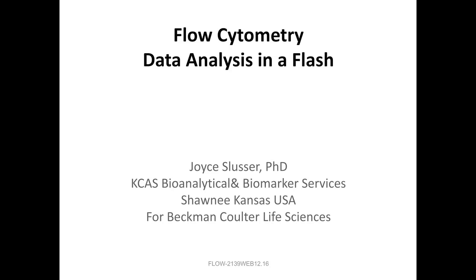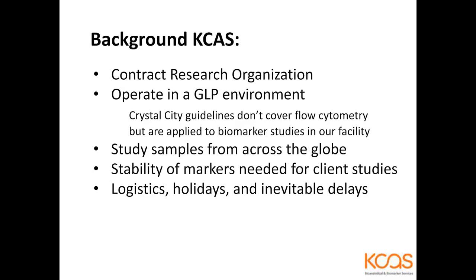Thank you so much for the introduction, and thank you to LabRoots and Beckman Coulter for facilitating, and welcome all. I would like to jump right into the presentation because I do have an extensive software demonstration I would like to do. So let's get rolling. My first slide is an introduction to the why KCAS and how we came to this presentation today.